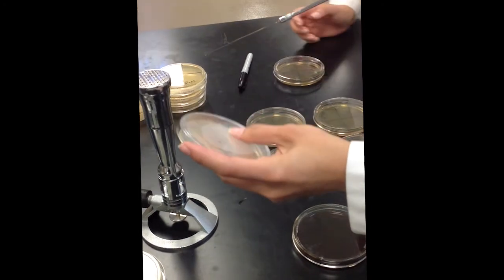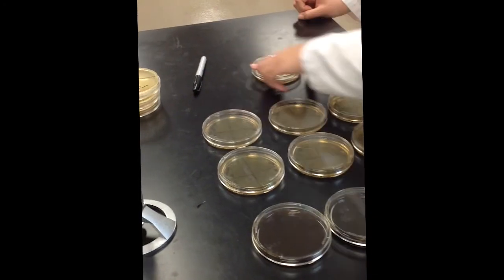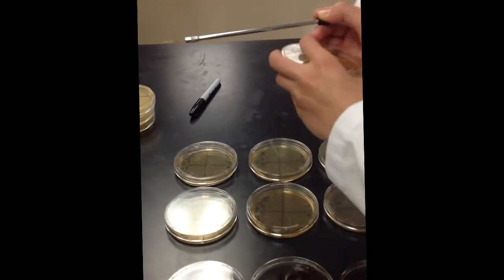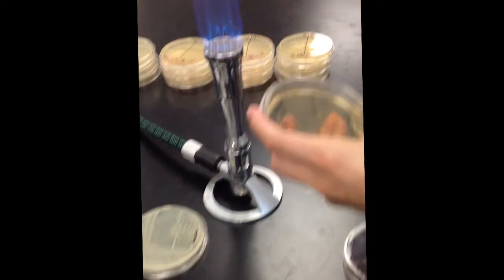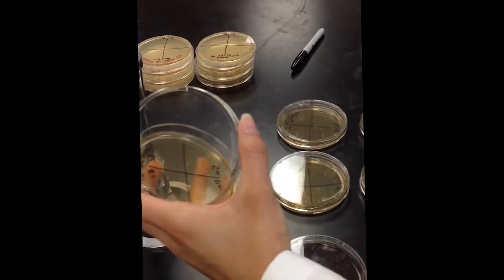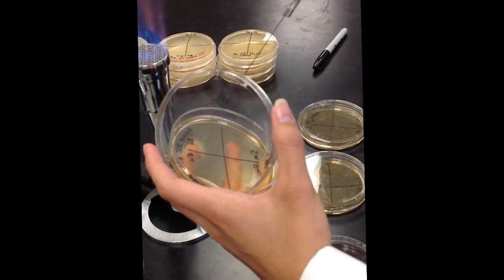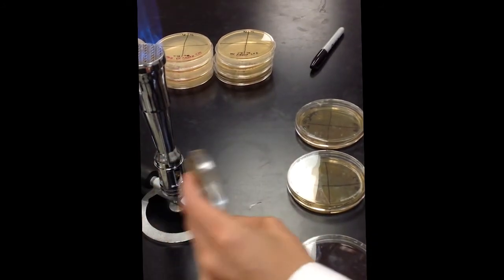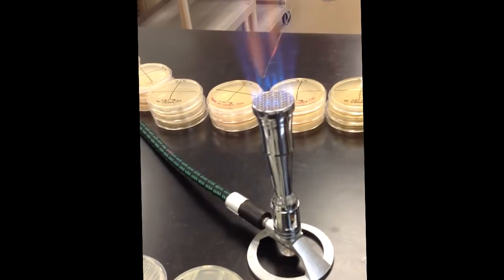During our inoculation stage, we sanitized our workbench, lit our Bunsen burners, and grabbed our inoculation wands. We sanitized our inoculation wands by burning them in the Bunsen burner. We then grabbed our nutrient agar plates with our appropriate concentrations, uncovered them slightly by the Bunsen burner, and inoculated the nutrient agar with the appropriate bacteria in the appropriate quadrant.